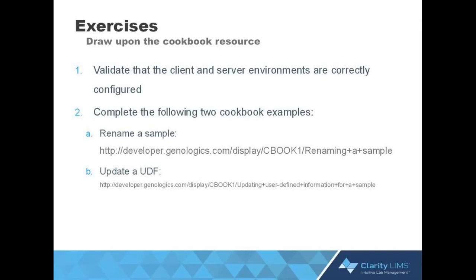Now let's complete exercise 2B of module 3. Here's a reminder of the exercise. As you can see for yourself, it's going to require another script from the cookbook.